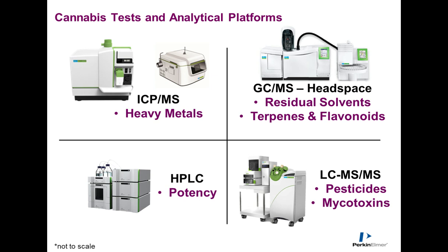This is a quick snapshot of the instrumentation that most cannabis labs need to comply with the California list. As you'll notice, it's a multiple instrument portfolio. Unfortunately, not one instrument is able to test all the chemistries in California. And this is similar for the other markets where testing is required, and also other countries like Canada.